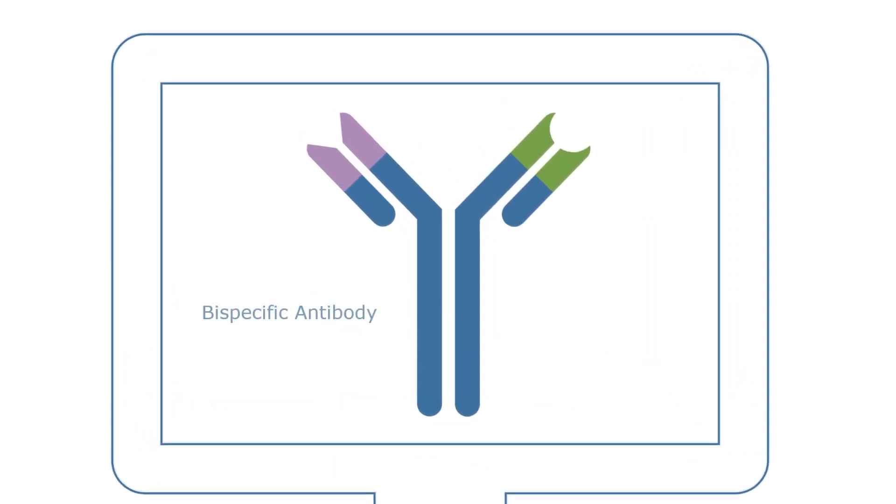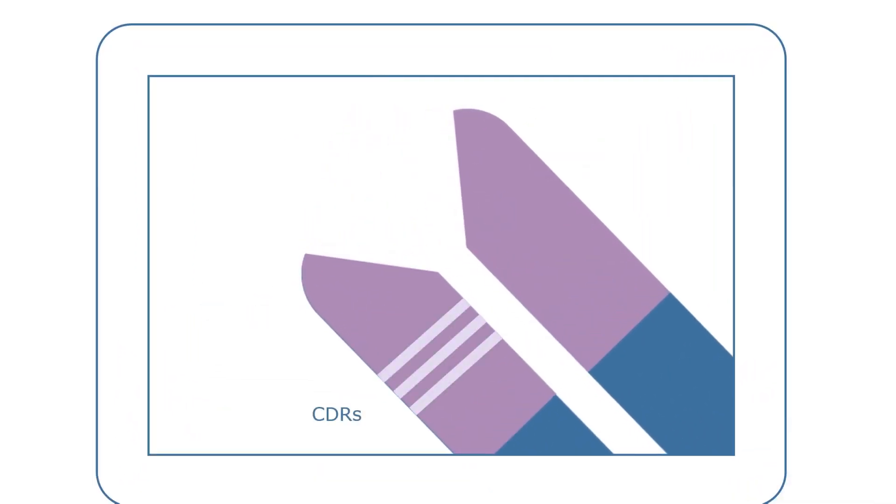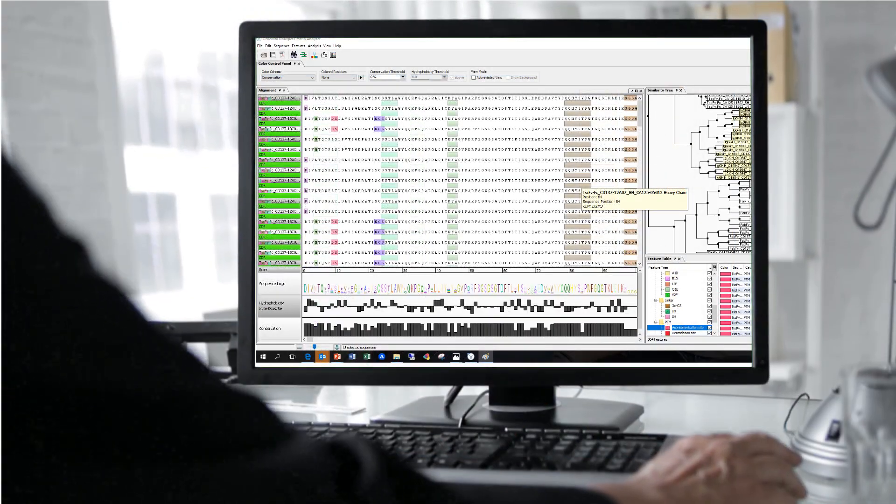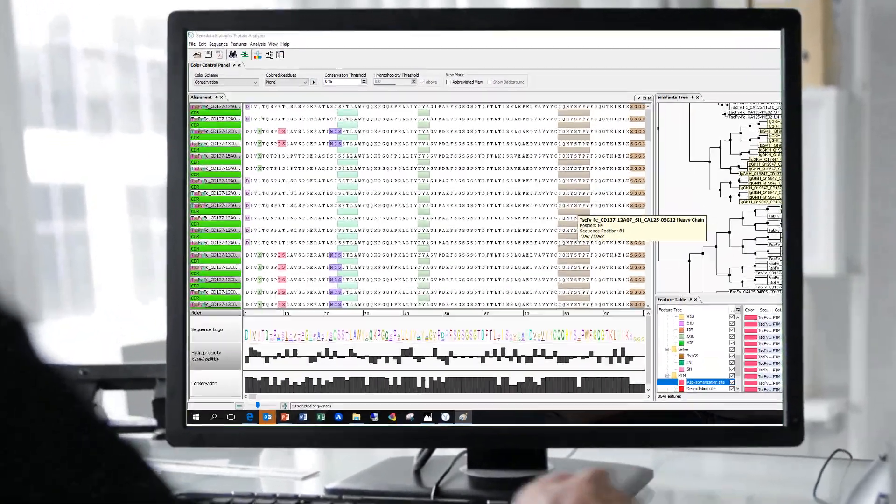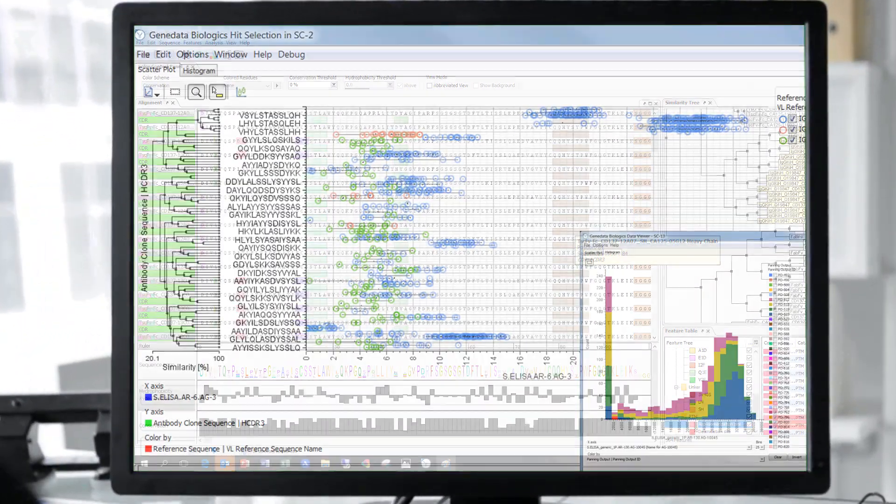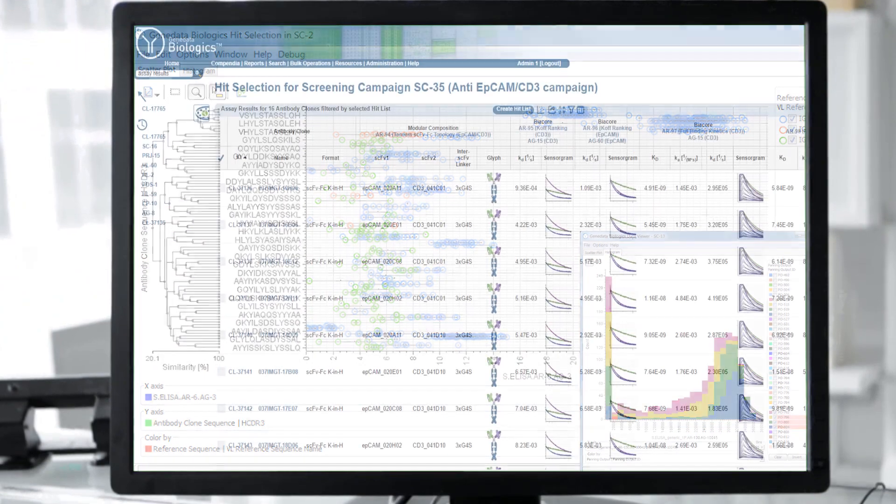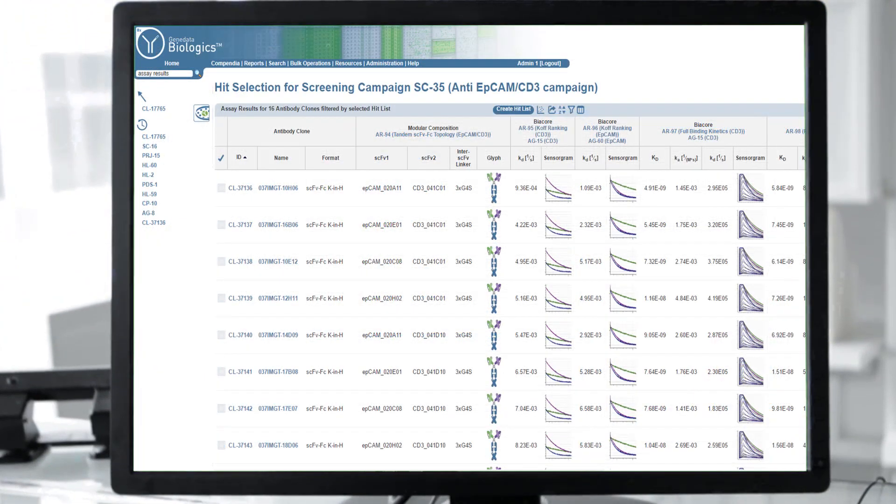It automatically performs data quality checks and tracks the full genealogy of all molecules and samples, such as the ancestors of a bispecific candidate.